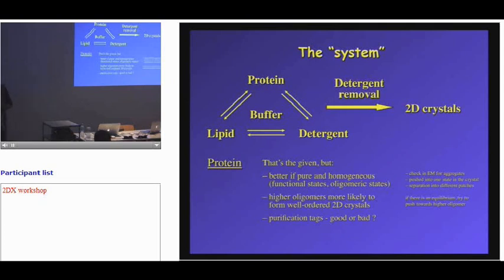In most cases, oligomers are also related to the function of the protein. When there are lower oligomers than tetramers, the protein is less stable, so it's difficult to compare with an unstable monomer. If you have obligate oligomers, then obviously if you don't have the oligomer, you're dead. But there are proteins that can make different oligomers. I do have an example, actually: we work with MP20, which makes all kinds of different oligomers as part of its function, and still we get 2D crystals which have only tetramers. I forgot about that.